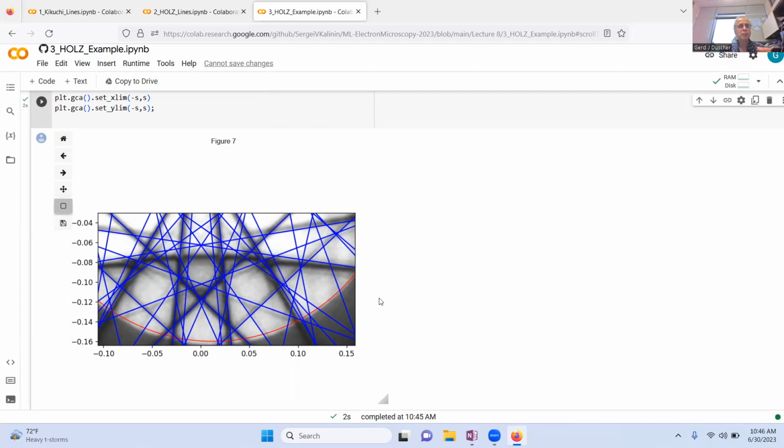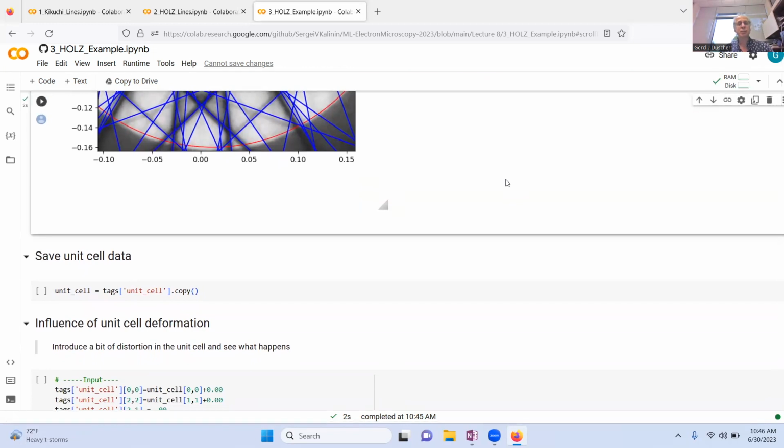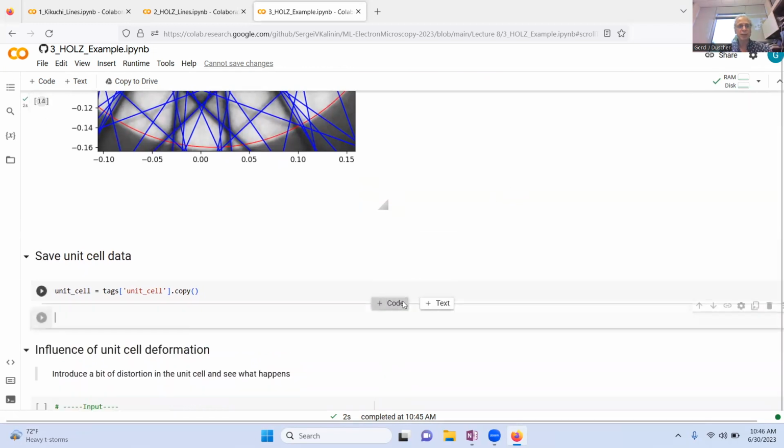mistilt, and you could actually probably reduce even that kind of disagreement. But look at this triangle of the weak ones. So the agreement is now astoundingly good. And the question is, what is it quantitatively, right?